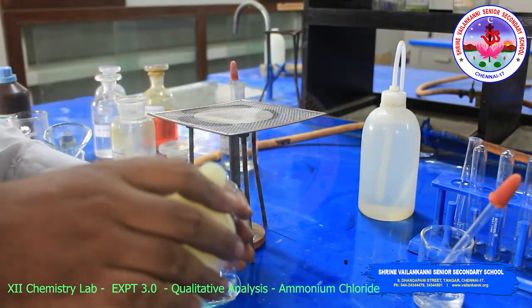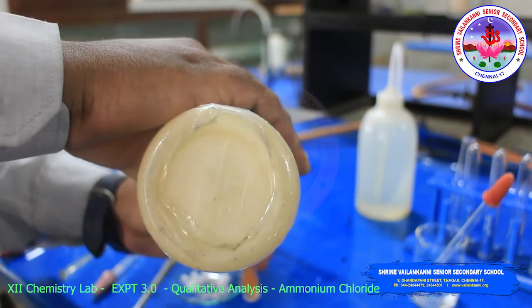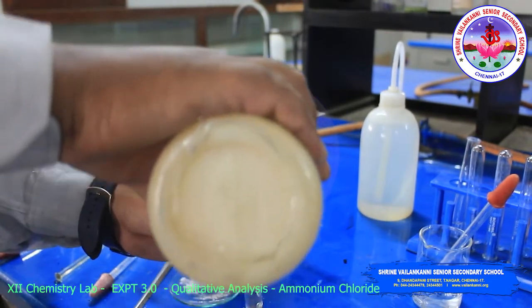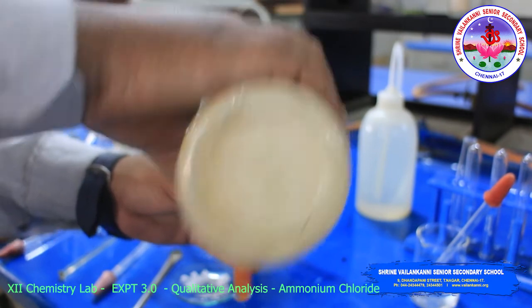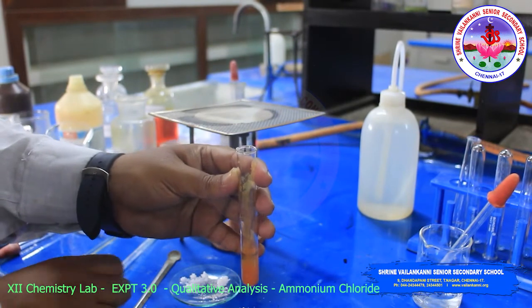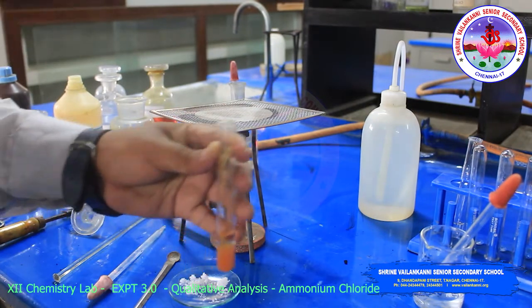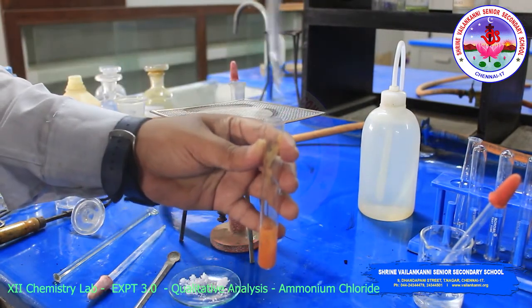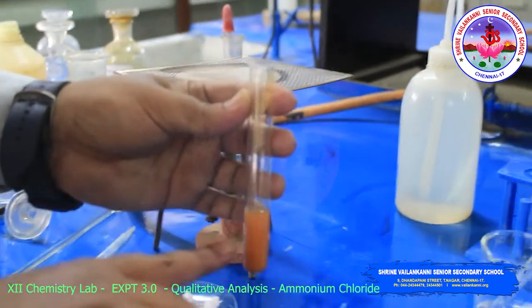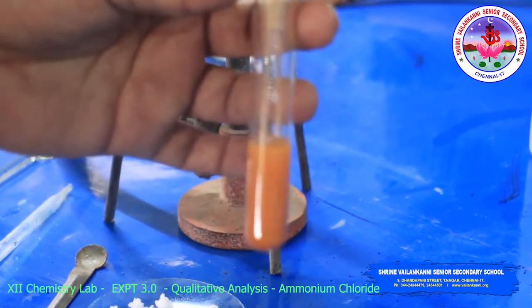This is Nessler's reagent. See here, the brown color precipitate is obtained. Then add excess of the sodium hydroxide solution. So a reddish brown or brown color precipitate is obtained. So this indicates ammonium is confirmed.